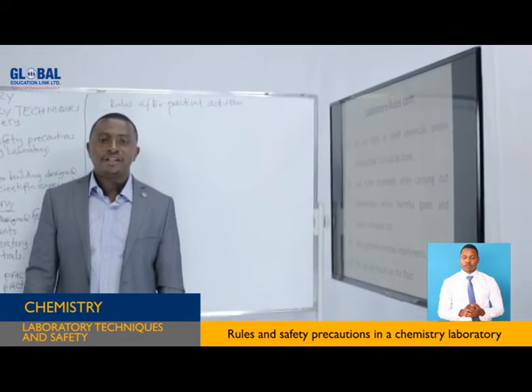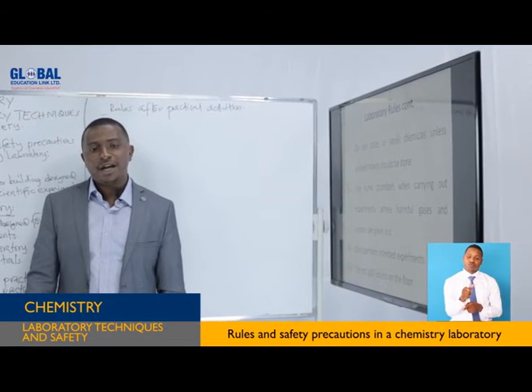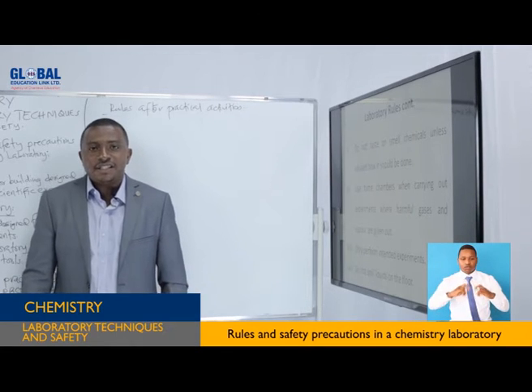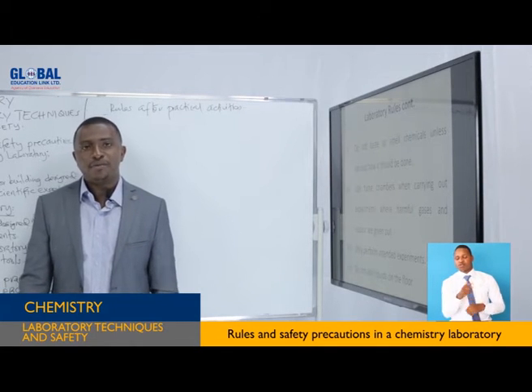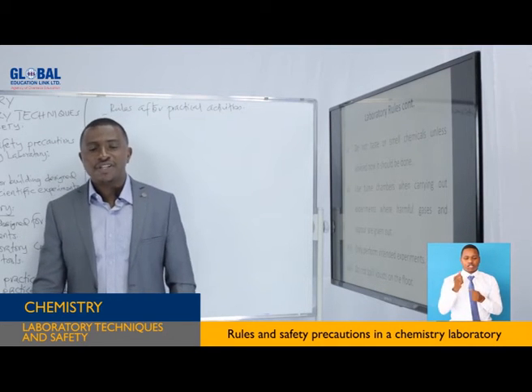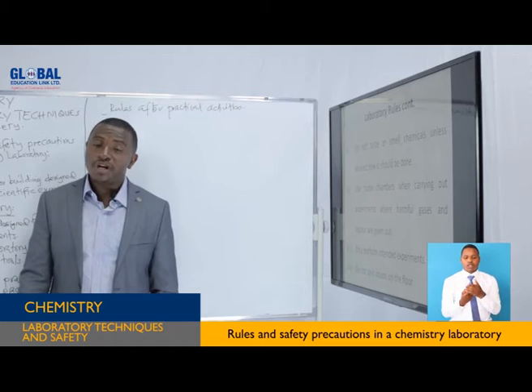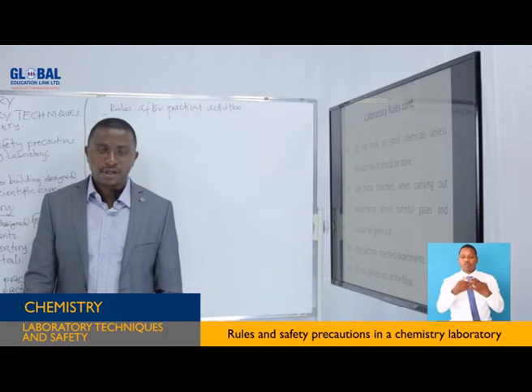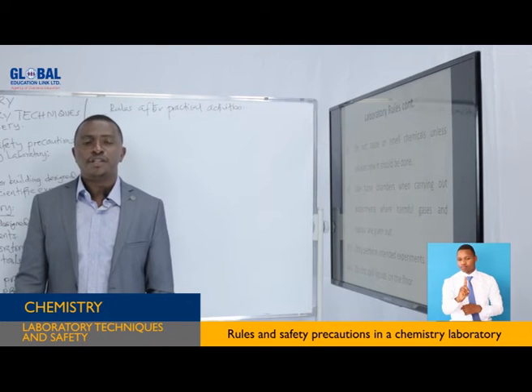You find someone has gone in the laboratory, after conducting his experiments, he sees that he still has time, or she still has time, and she can decide to test something to see what results will be. You are actually advised not to conduct your own experiments, not to interfere with others' experiments.